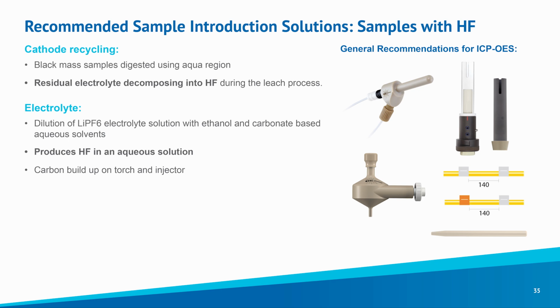In the final section of today's webinar, I will recommend products for the analysis of battery samples that contain or use any concentration of hydrofluoric acid. As an example, in cathode recycling, the residual electrolyte can decompose into hydrofluoric acid during the leaching process. Additionally, when working with lithium hexafluorophosphate, an electrolyte solution mixed with ethanol and carbonate-based aqueous solvents, we need to be mindful that this can also produce hydrofluoric acid in an aqueous solution.